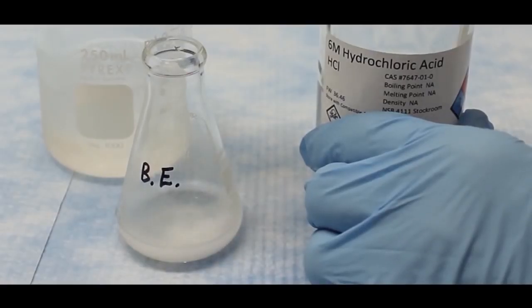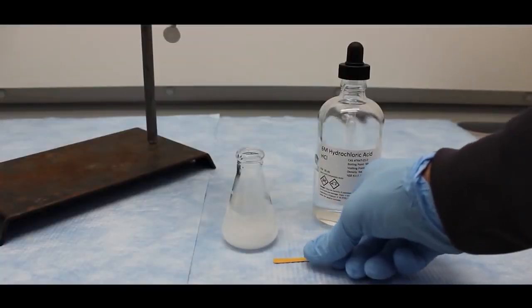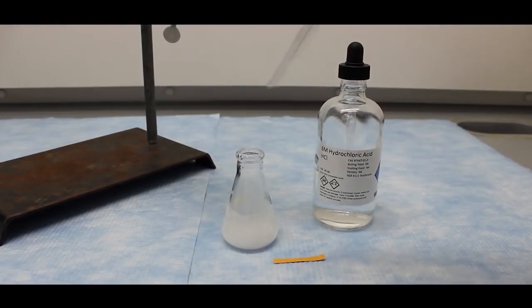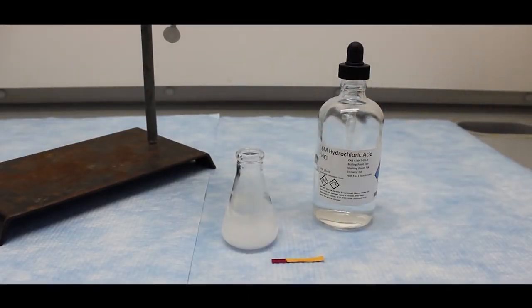Formation of benzoic acid as a white precipitate is noticeable. After adding approximately 5 milliliters of the HCl solution, I will now test the pH, which is the same as the HCl solution, and confirmation that all the sodium benzoate has been converted to benzoic acid.